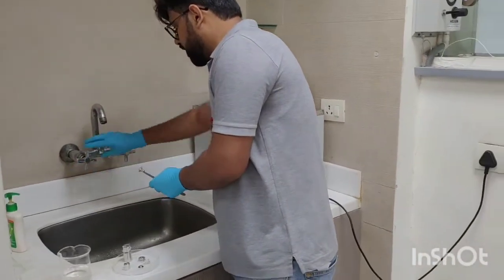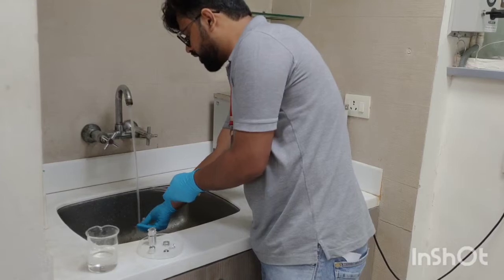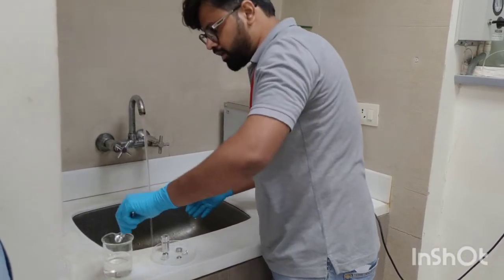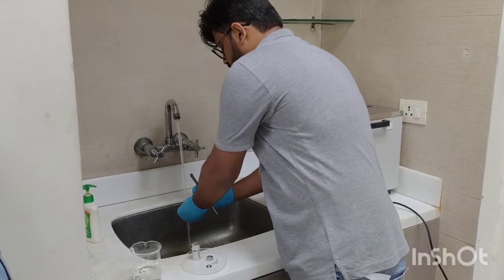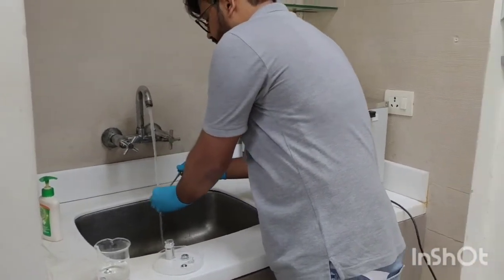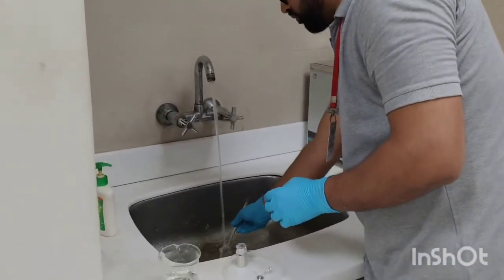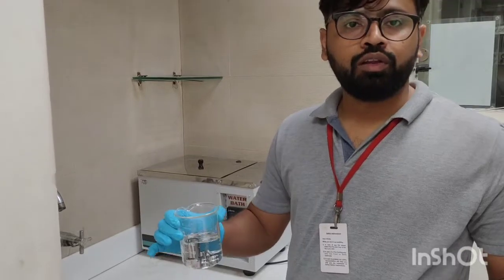We are cleaning all these parts in running water to remove any aluminum oxide powder particles. After cleaning in running water, place them in acetone one by one, and use your finger with gloves to remove any powder which is present after rinsing. Now we have cleaned all parts in running water and kept them in acetone. Now we will use the sonicator.